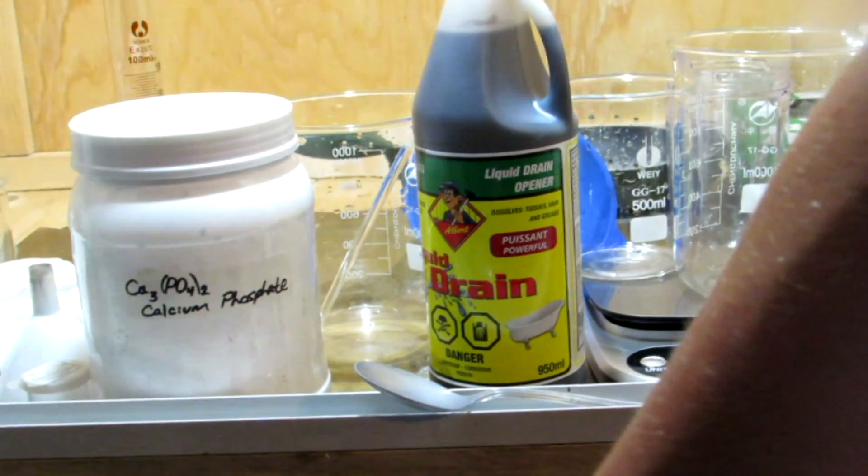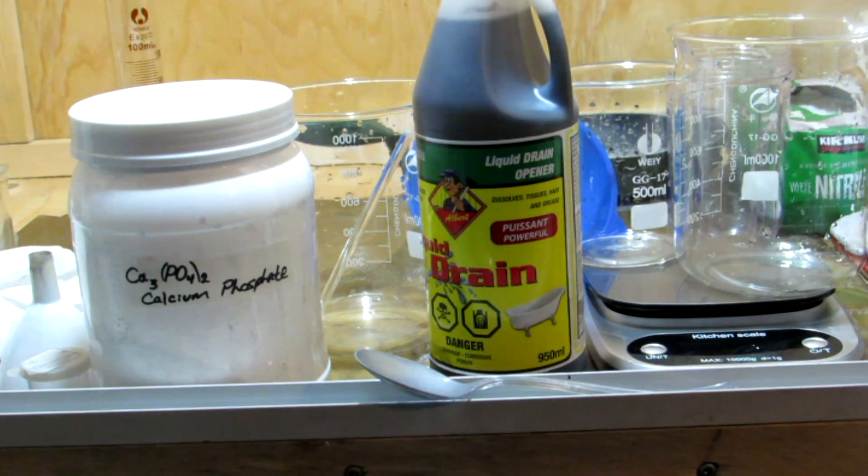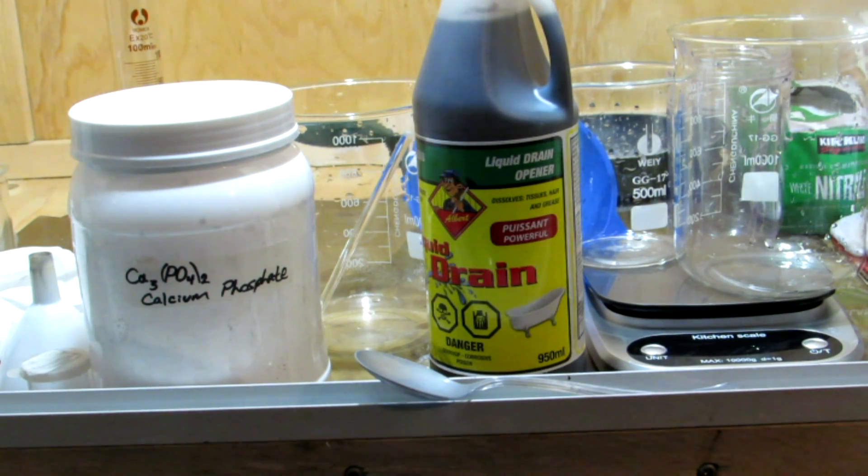We're going to be making this with the eventual goal of making some white phosphorus, so stay tuned for that. We're going to be adding the sulfuric acid to the calcium phosphate, and this will precipitate out calcium sulfate from solution, and we'll be left with a solution of phosphoric acid. We can then partially neutralize this to form our monosodium dihydrogen phosphate.